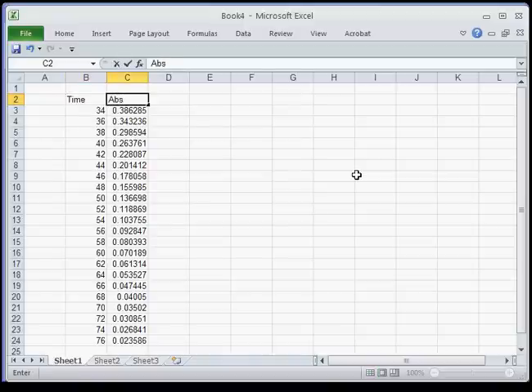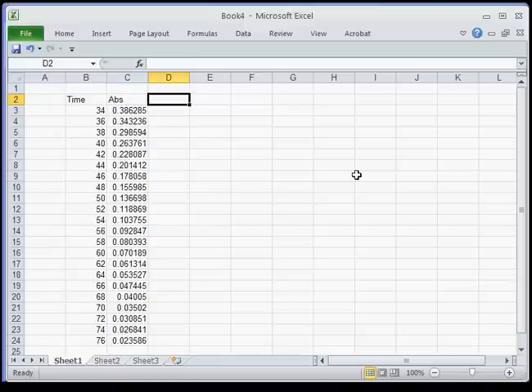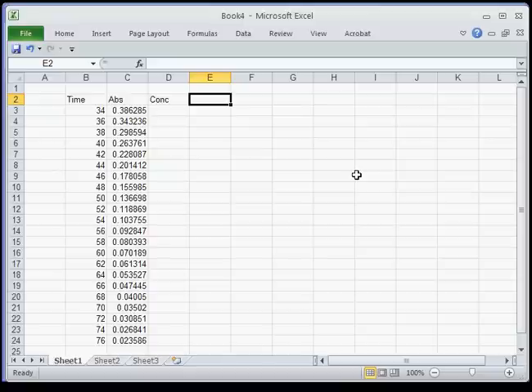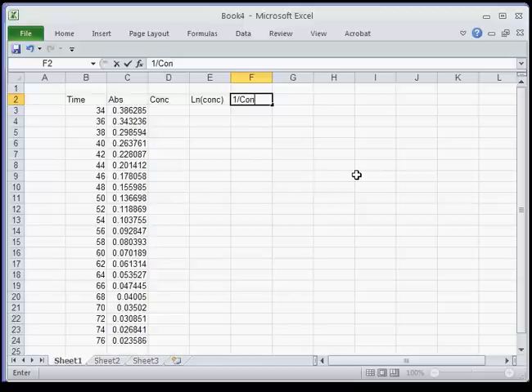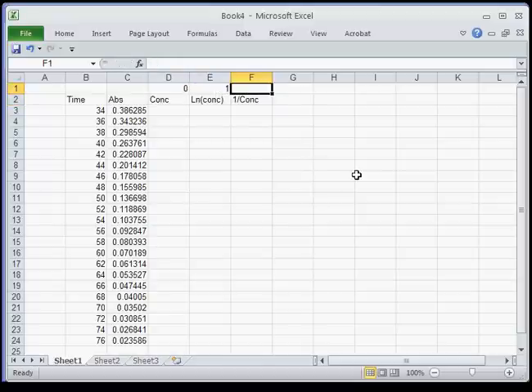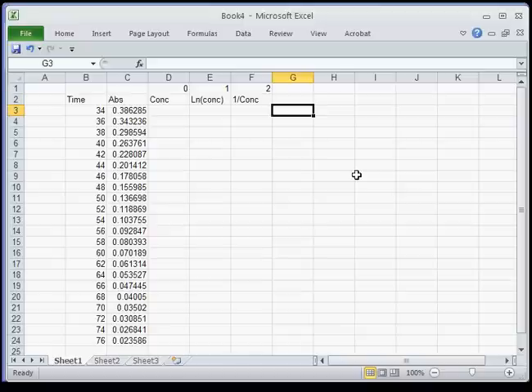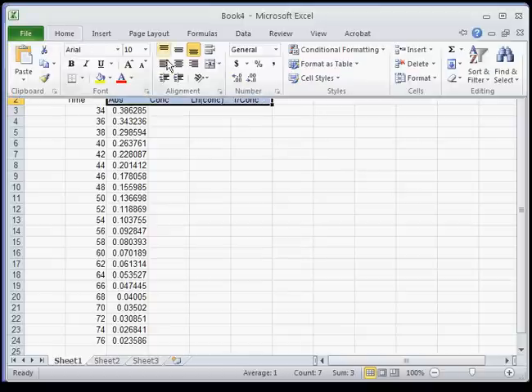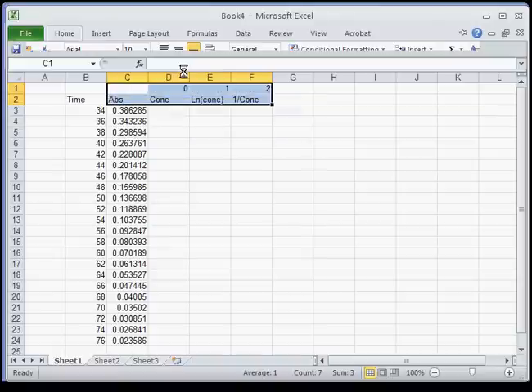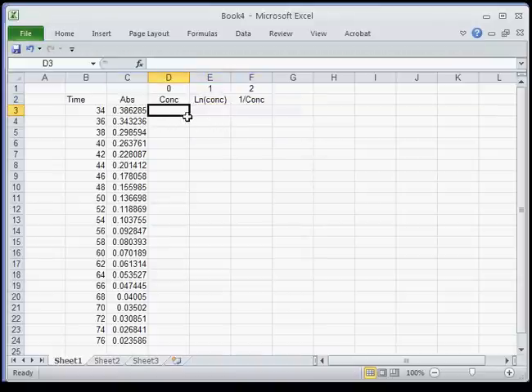This is absorbance. Now absorbance is not concentration, so what we're going to have to do is correct that to be concentration. I'm typing the headers in using the cursor keys to move over: natural log of concentration and one over concentration. If you remember, this is a zero-order plot, a first-order plot, and a second-order plot. I just put those up there to help remind you.